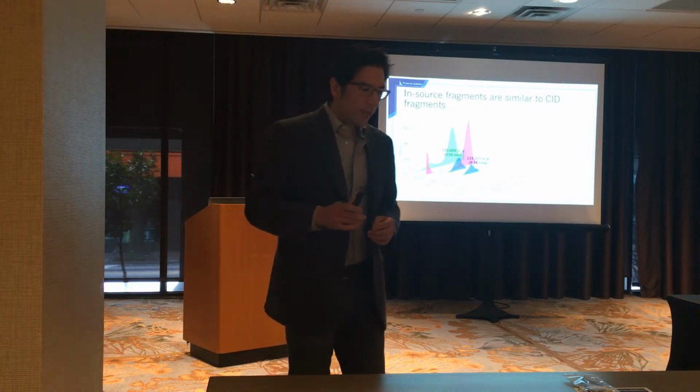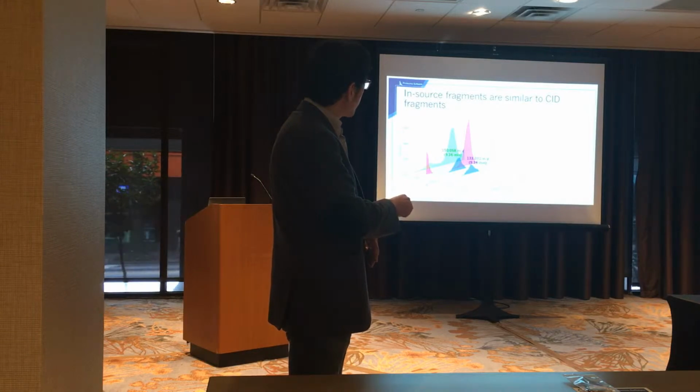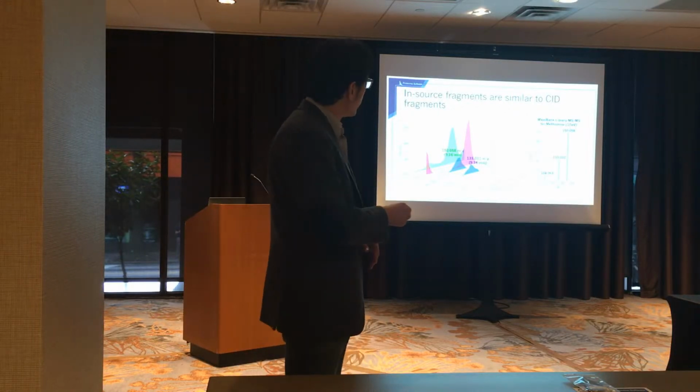So let me just show you what some of this data looks like. I've got this figure here. I've got retention time on this axis and precursor m/z on this axis. This feature right here is also co-eluting with another feature right here. And if I look in MassBank, this one assigned very cleanly to methionine.